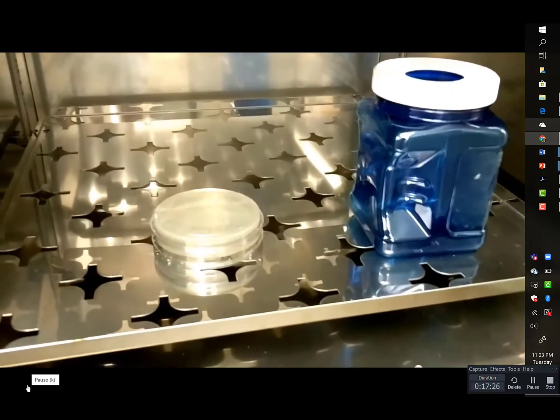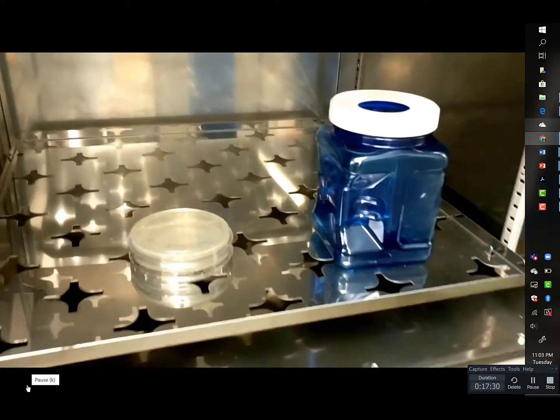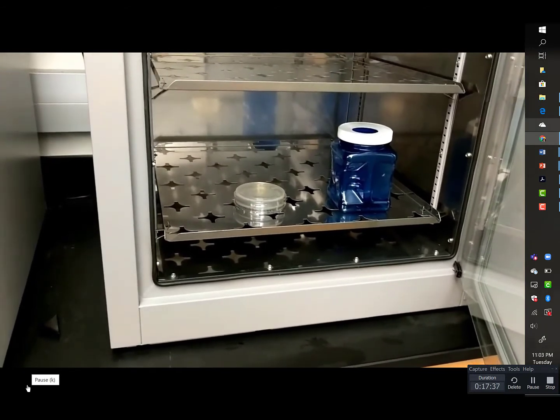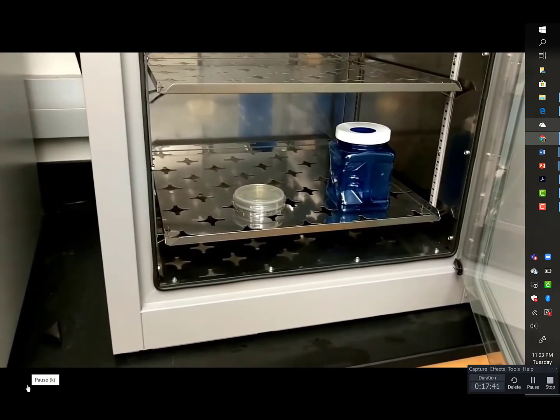The bacteria like it warm, they like it with a high moisture content, and at 98.6 they will grow at their best rate, so that 2 days from now we will have some nice colonies growing on there that we'll have a chance to make some observations on.